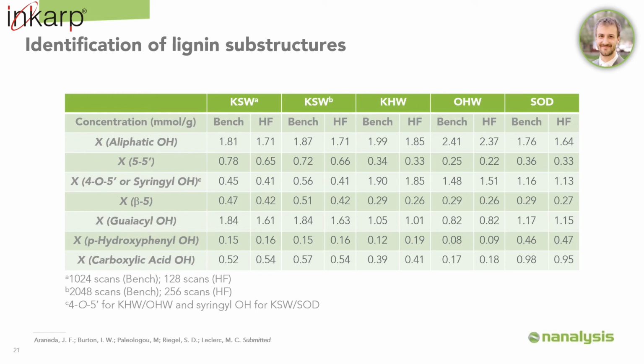This essentially means that we can accurately and reproducibly determine the composition of various lignins such that anyone working with these products can ascertain what the value of these products might be, so that we can use some of the great catalysts that have been developed to break down the most valuable lignins into their monomeric units, instead of obtaining these through petroleum feedstocks.